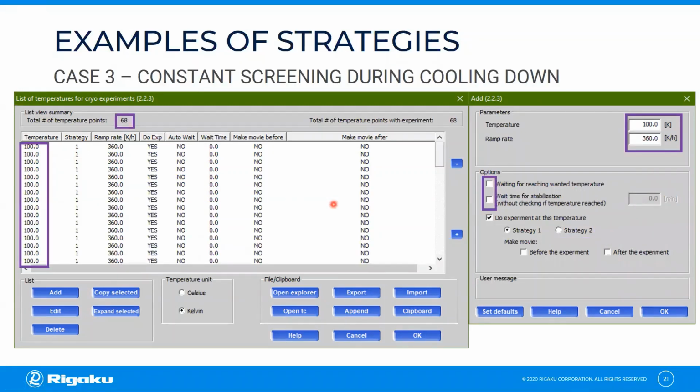Case 3 is quite interesting. That'll be by the extremely quick new generation of instruments that allows you to collect data very quickly. That makes it very hard to check the ramp temperature and stabilize the instruments.